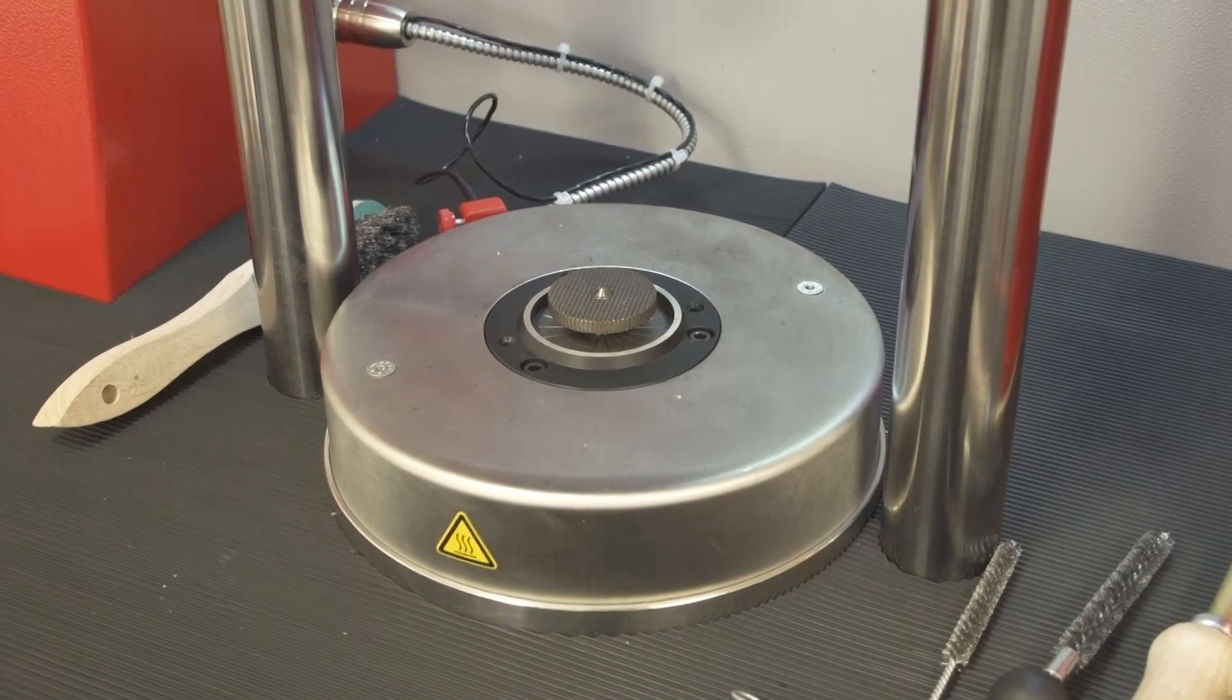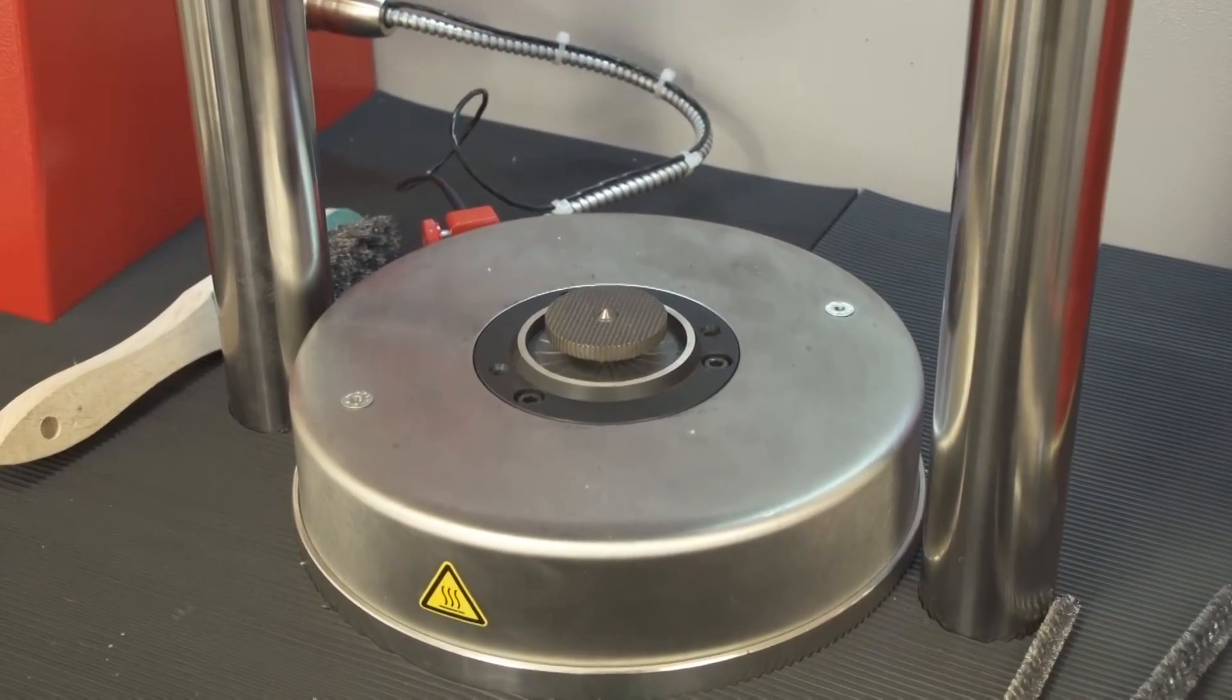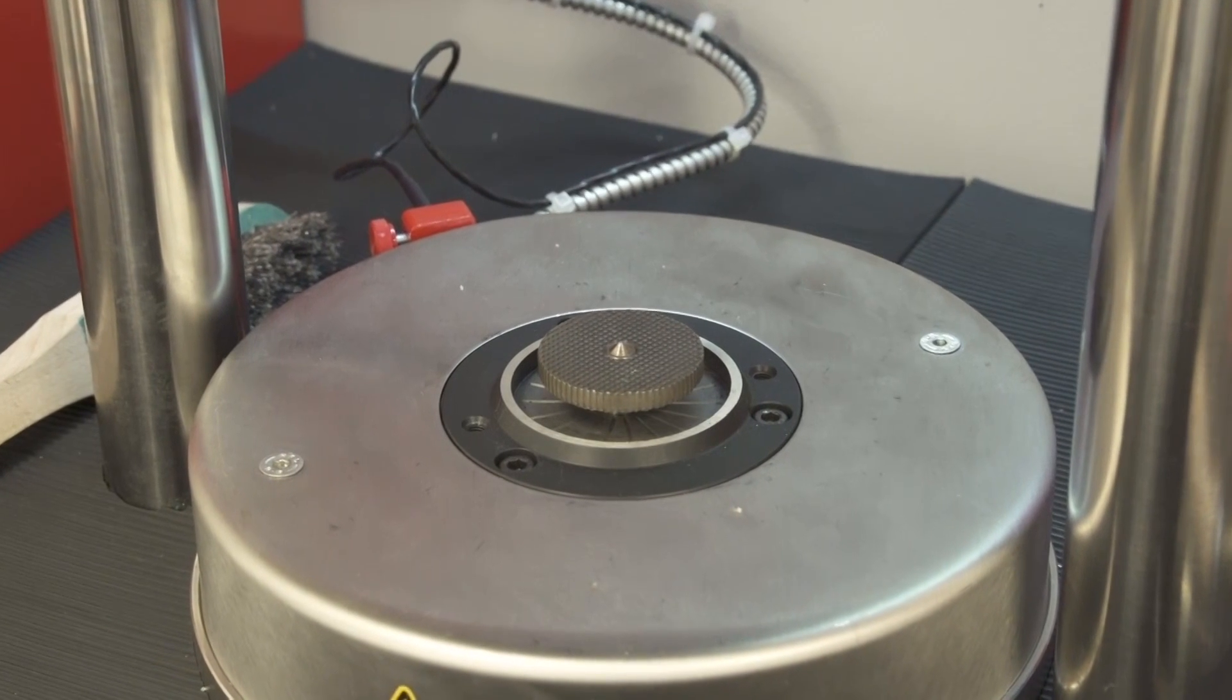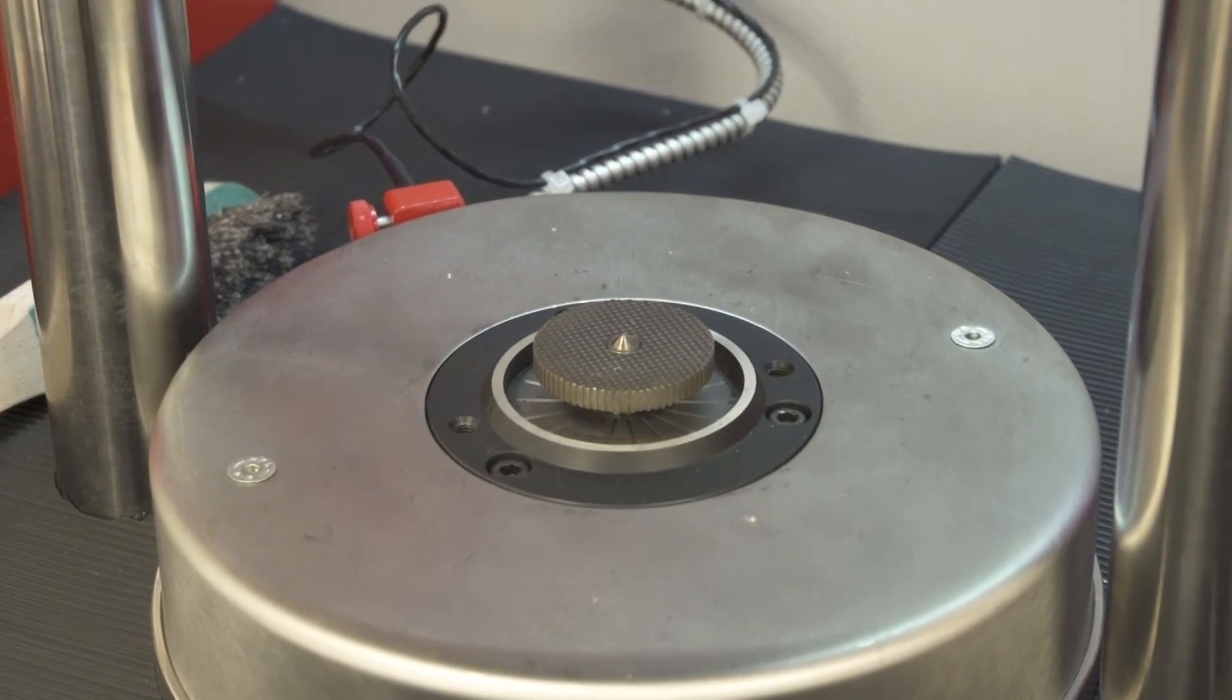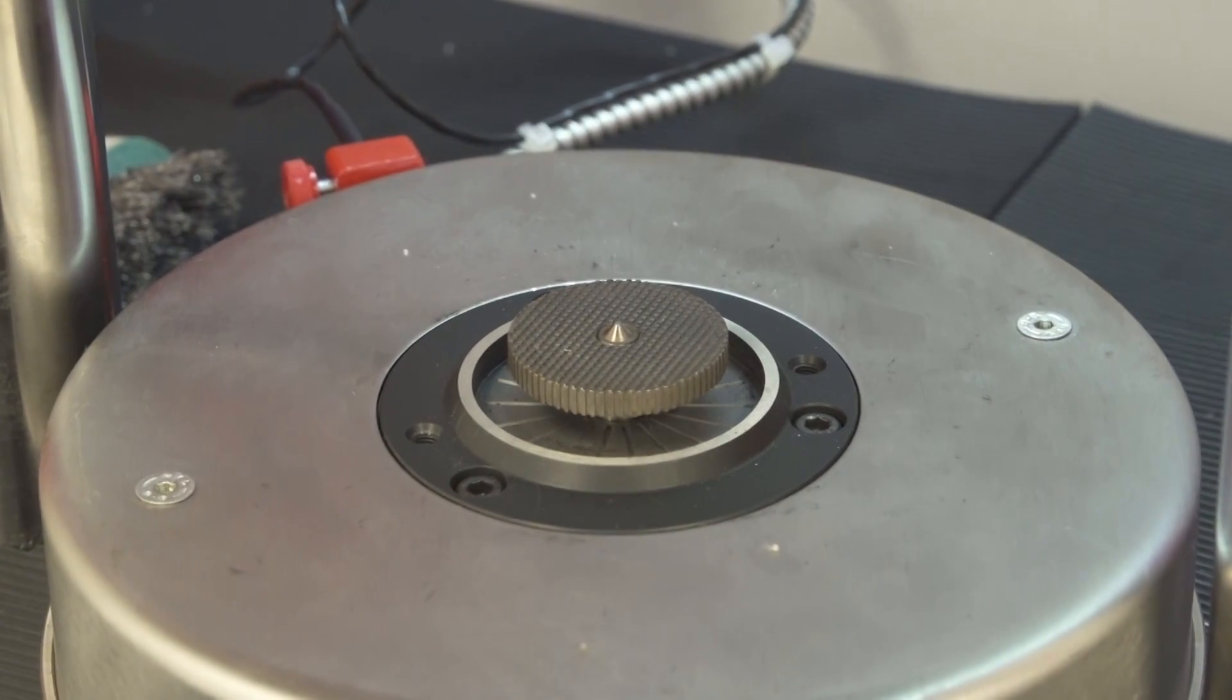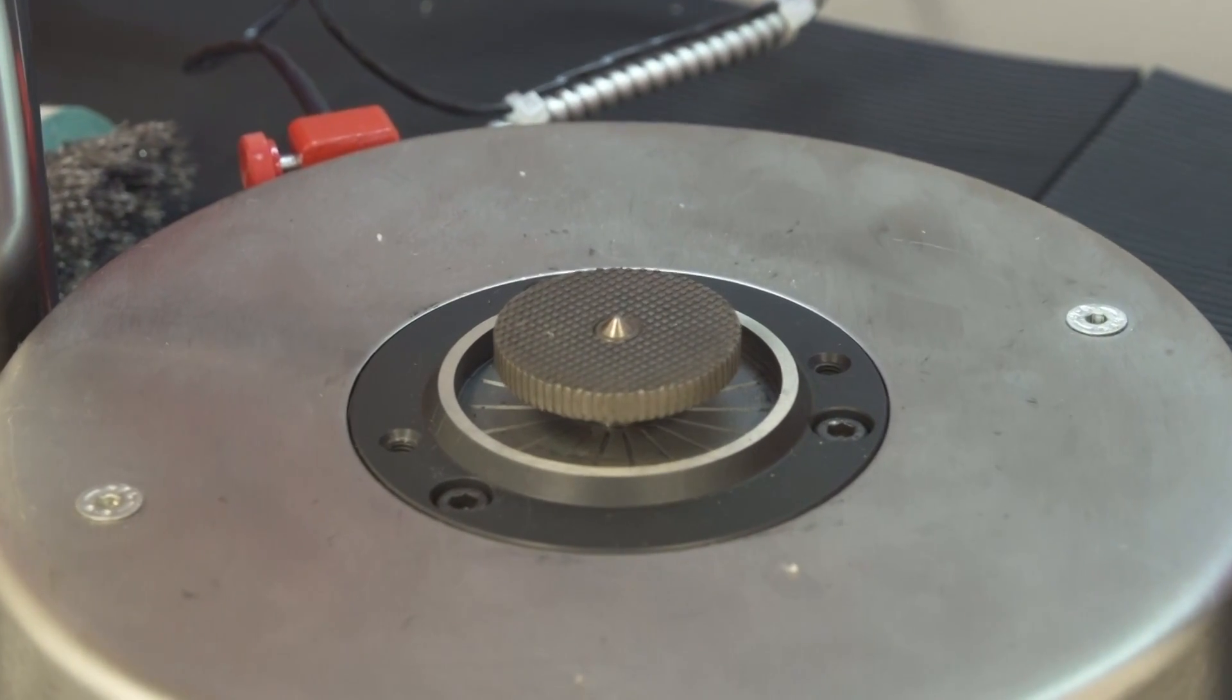Whenever the test temperature is changed or after every twenty-five tests, a balancing of the Mooney viscometer is required. Balancing means that the friction of the rotor seal is measured, which is then used as a compensation during every test.